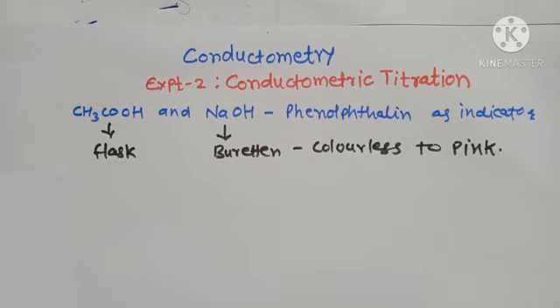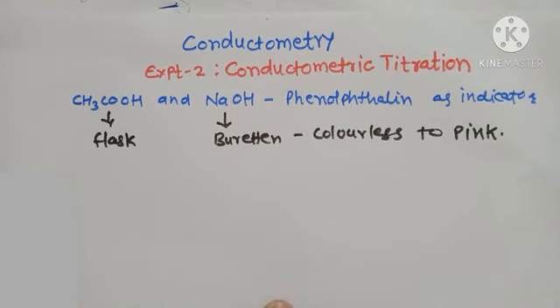Okay. Now the same titration can be carried out by conductance measurement.